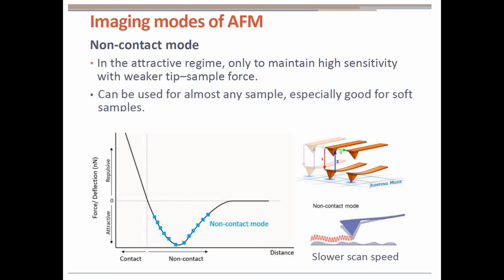We also have a non-contact AFM mode. In this mode, the tip of the cantilever does not contact the sample surface. The cantilever is instead oscillated above the surface. The van der Waals force or any other long-range force that extends above the surface acts as the attractive force, and they decrease the resonance frequency of the cantilever. Because it is non-contact, the sample surface is not damaged. This makes it preferable for measuring soft samples such as biological samples and organic thin films.